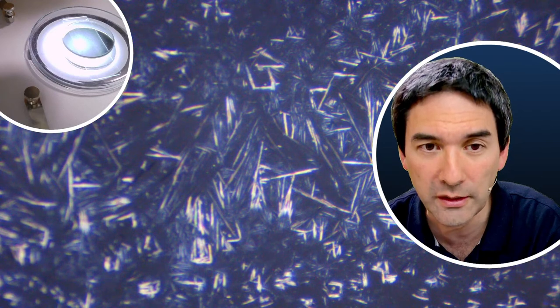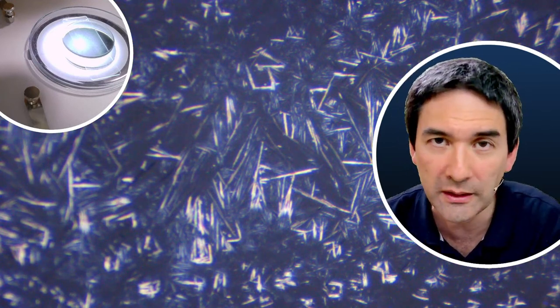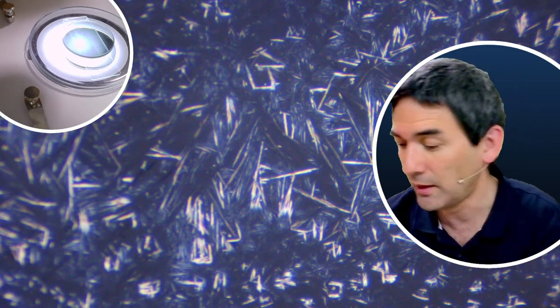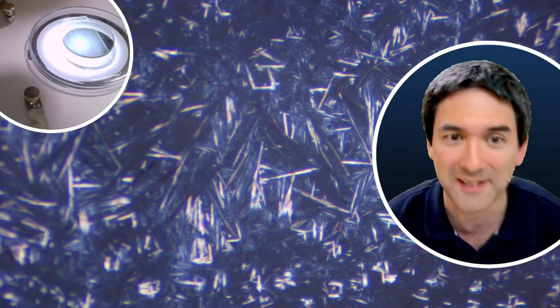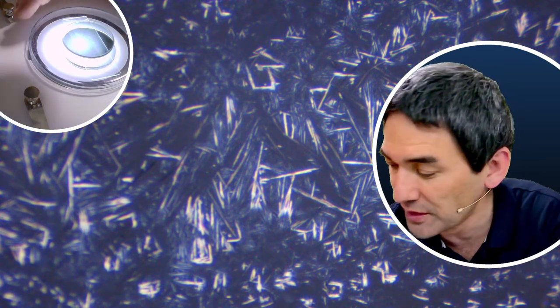That's why alcohol has a certain advantage, because it evaporates so quickly. That means you don't even have to do time lapse. Okay, I kind of like this, so maybe we're just going to try this again. Or you know what, before we try it again, let's have a look at those crystals first, okay?